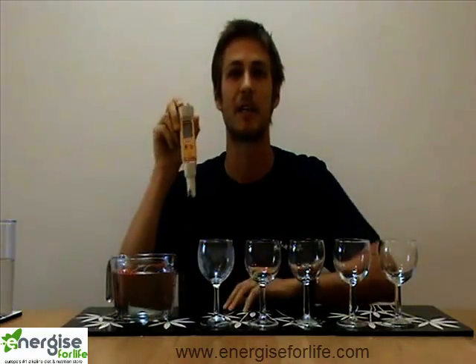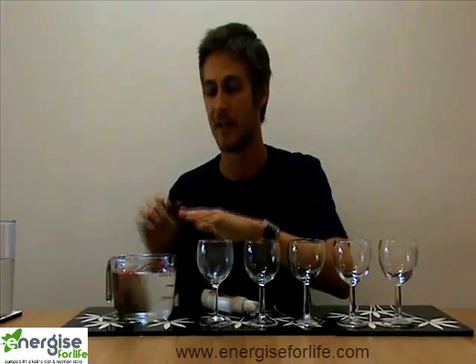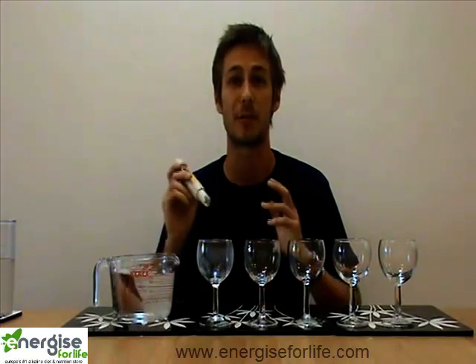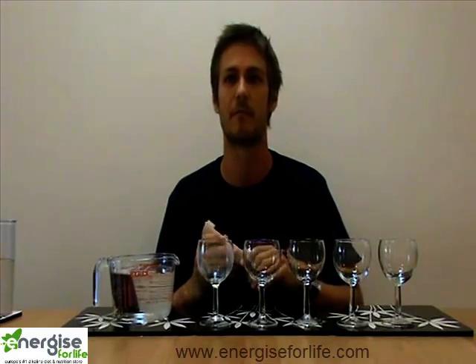Ideally, with our liquids in particular, and as I'm going to try and show you here, we're aiming for anything above about 8, which is a really good level to aim for. So the exciting part: I have a pH meter here. I'm going to pour out a series of drinks. We've got a cola, a diet cola, some orange juice, and then some wine, and unfortunately for most of you, some beer as well. And then I've got here a litre of just normal tap water. I'll dip this in and test the pH of the tap water, which we're hoping is going to be around 7-ish, but tap water can vary wildly.